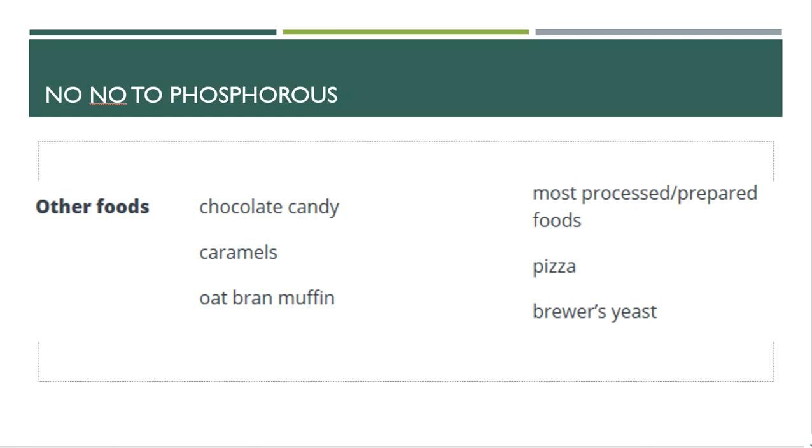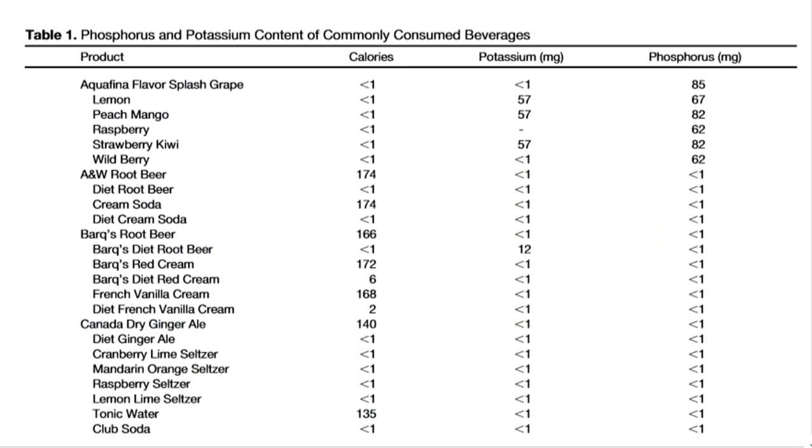Well, this lab is not going to be looking at any of these food items, all right, except for one. And that one will be your drinks. We're going to limit this down to what we want you to measure and compare. So we're going to do something very simple. We don't want you to process samples very heavily in the lab. We just want you to get into the lab. We want you to take these soda samples, which are already a liquid, just dilute them down a little bit. It's going to be very quick, painless, it's easy, and then we'll run it on the equipment.